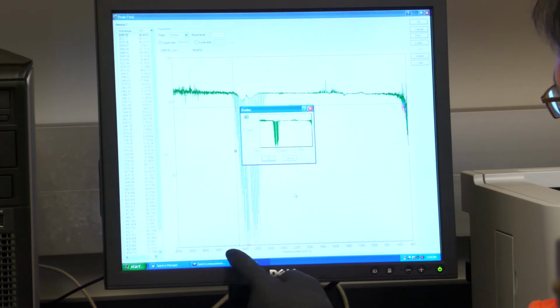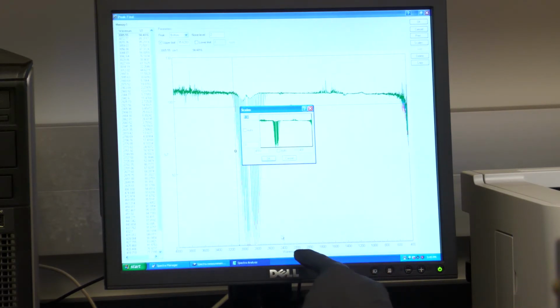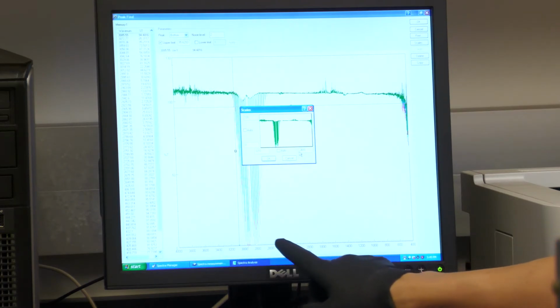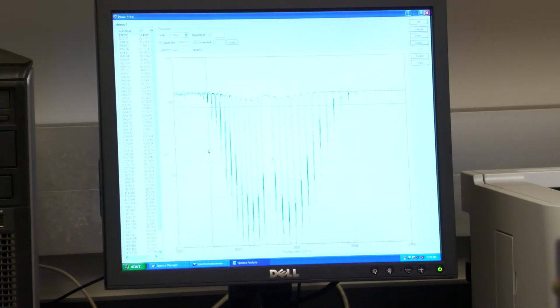You can see from 3200 to 2600 already covers most of them. So we can see from 3200 on the x-axis to 2400. So 32 to 24, that will spread this one out. Okay, so you can see this one, okay?